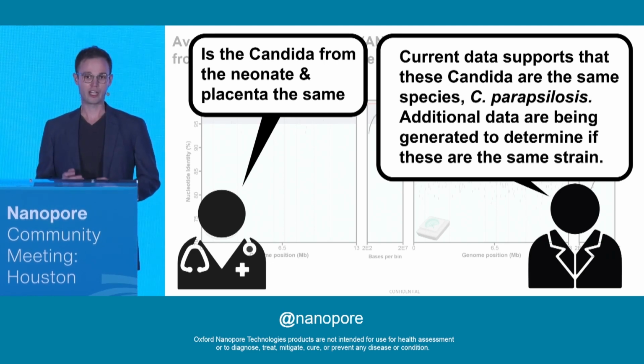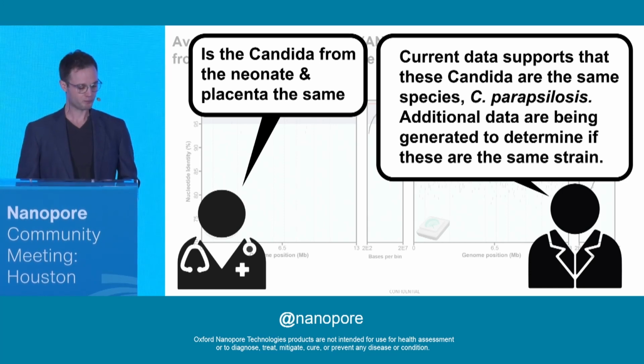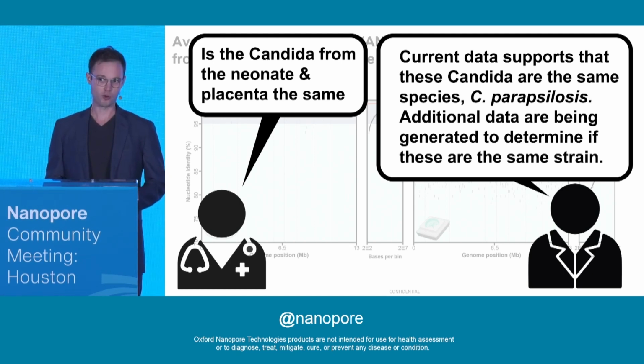Moving forward, we're currently collecting additional data to improve the base accuracy of our assembly, as well as look into some potential strain-specific structural variation that we've seen, both of which are necessary for performing functional and phylogenetic analyses that we will be including in a publication of this long-read-only assembly of an important human pathogen.